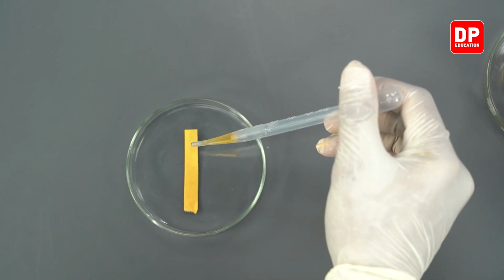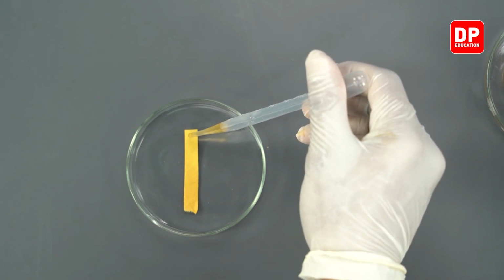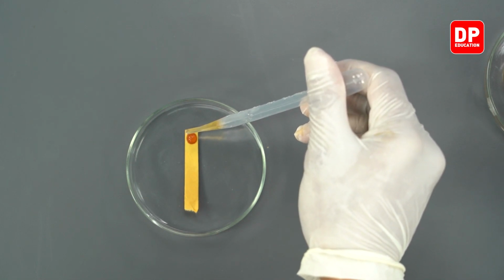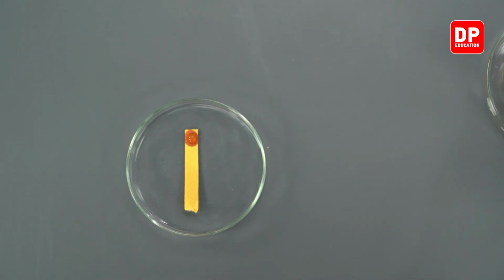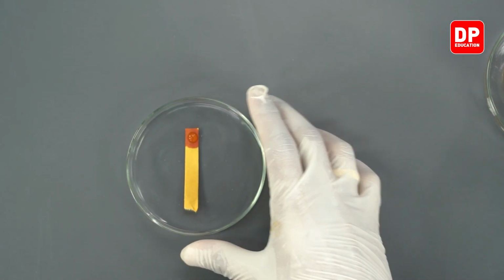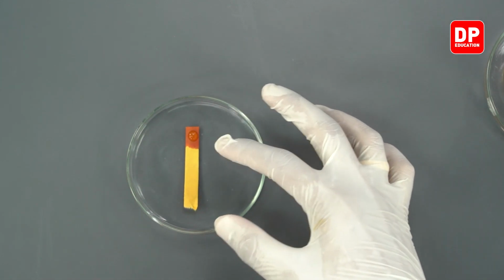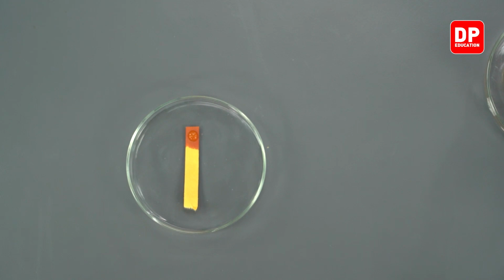Let us see what happens when a drop of ferric chloride is added to our pH paper. As you can see, the color of the pH paper turned a red color.